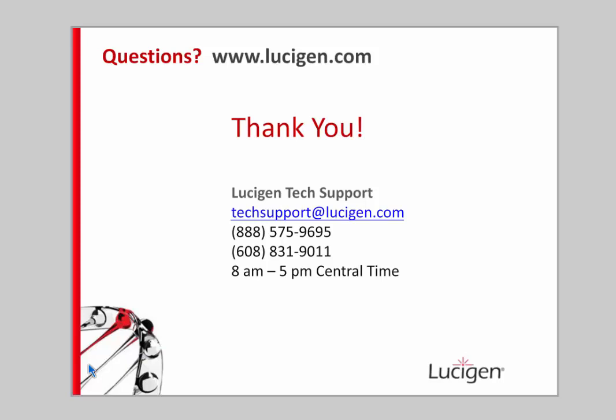And in regards to expression levels, this is from Rob, how does the highest level expression from the Rhamnose promoter compare to the highest level expression from the T7 promoter? Sure. So the T7 promoter is going to be the highest expression level that we can get, really. The Rhamnose promoter is close. If you have it all the way up at 0.2% Rhamnose for induction, it's going to be very high, but it likely will not be quite as high as the T7 promoter.